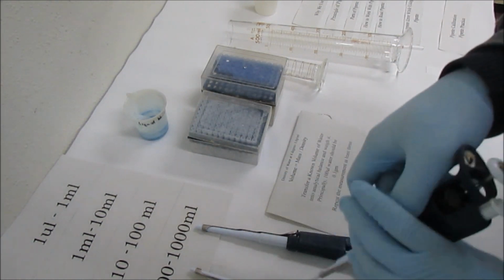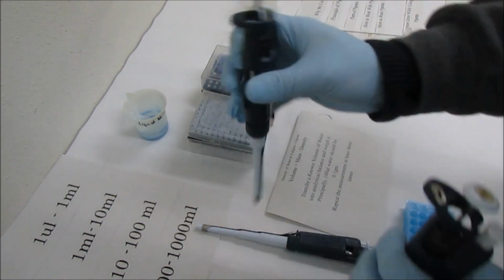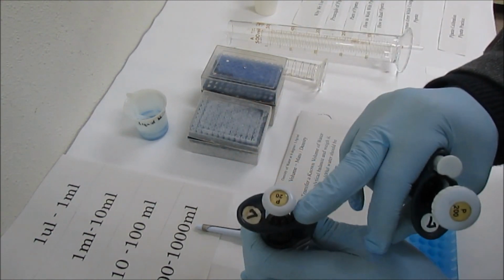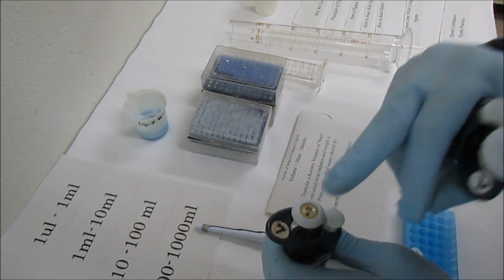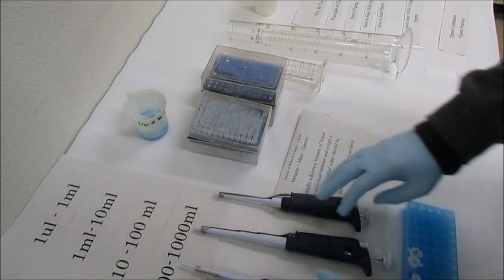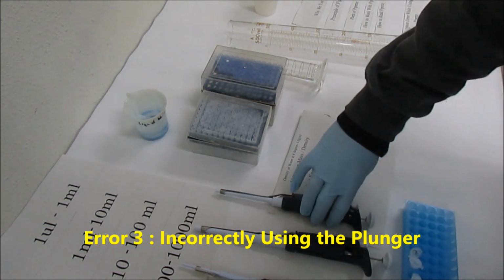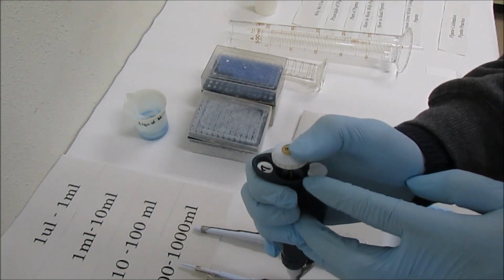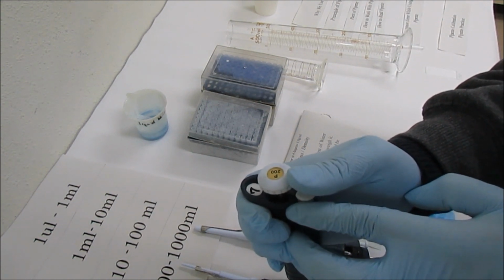Same case here. Suppose you want to measure 20 microliter, we will not use this pipette because this is a minimum limit. This is a maximum limit. We always use the pipette of maximum limit, right? Third is to correctly use the plunger. You have to press down and never leave it suddenly like this.